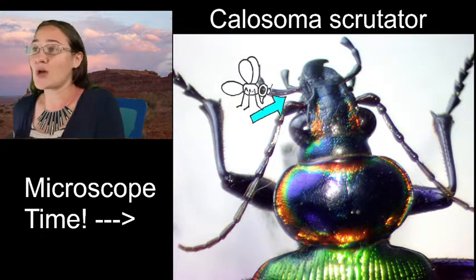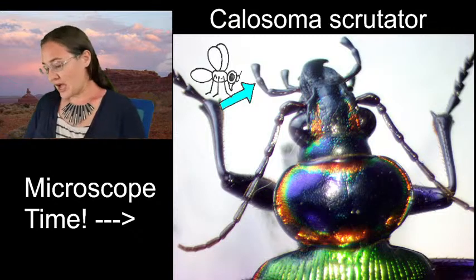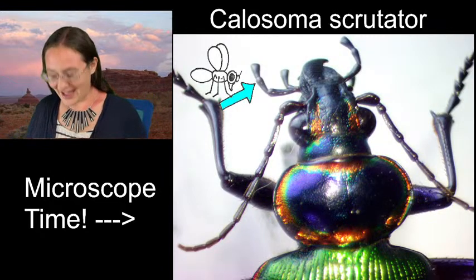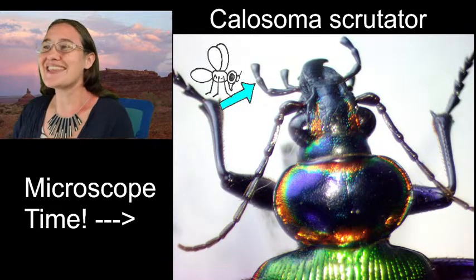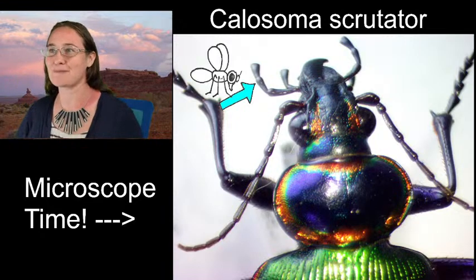And these right here coming off of the mouth parts, those are palps. My common name, as you know if you've been hanging out with me long enough, I love to call those mouth fingers because they are up near the mouth and they're jointed and they help kind of push food into their mouth.